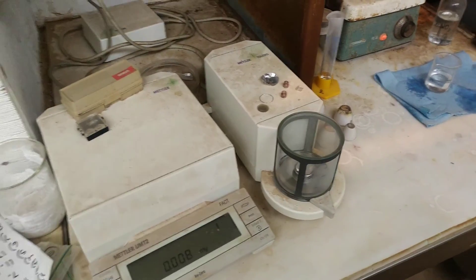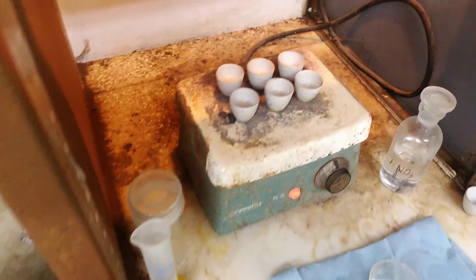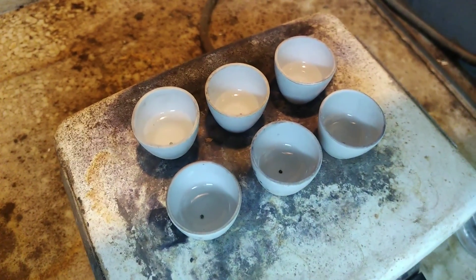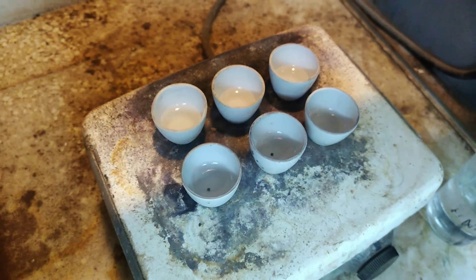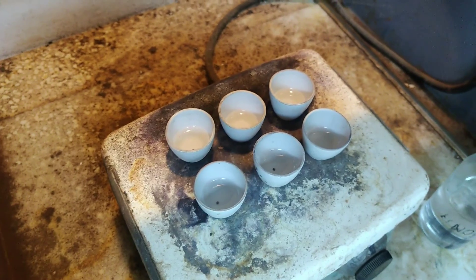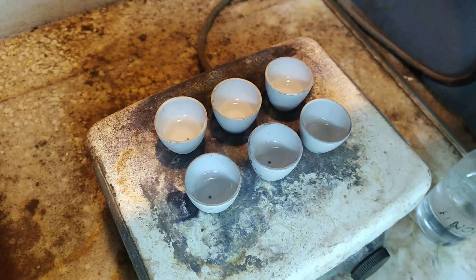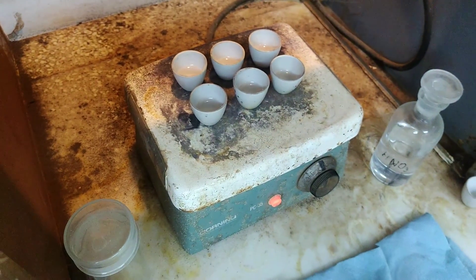Those doré beads have been weighed on this microbalance, which is a delicate process. Then they'll be placed into nitric acid in those crucibles — it's pretty strong stuff. What I'll do is dissolve the silver and leave behind a gold bead. It's been placed on a hot plate for a little bit of heat to catalyze the process.